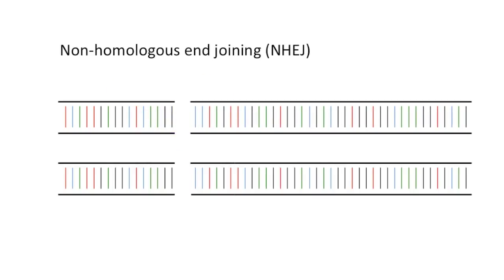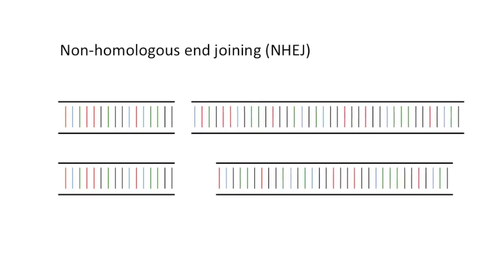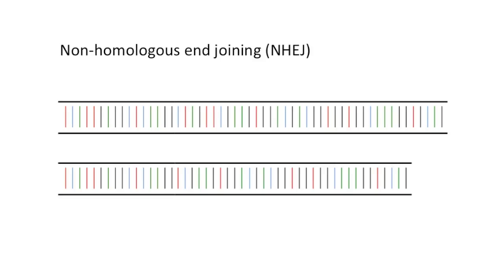The wild-type CRISPR-Cas9 complex is targeted by a guide RNA to a specific region of the genome, where it introduces a double-strand break. The cell's endogenous DNA repair mechanisms repair this break by non-homologous end joining. However, this is prone to errors incurred in a largely random manner. In a diploid cell, this generally results in two different alleles.